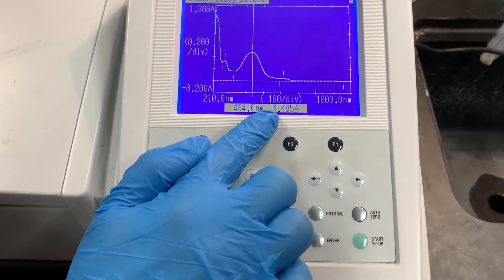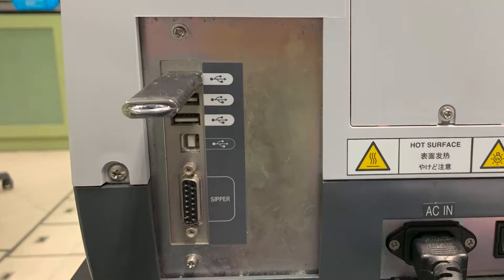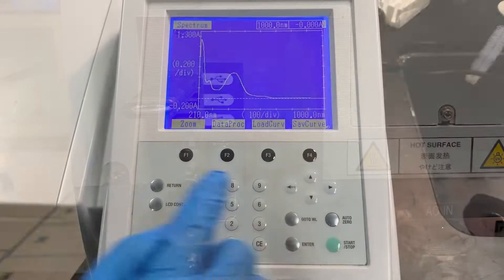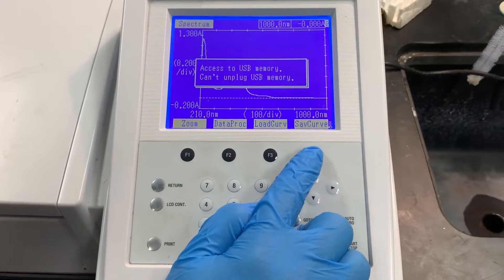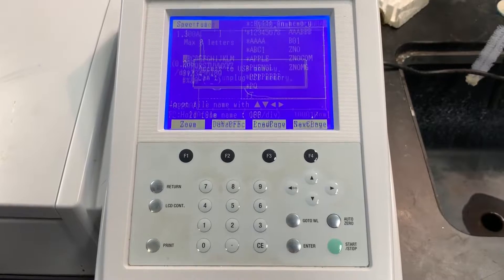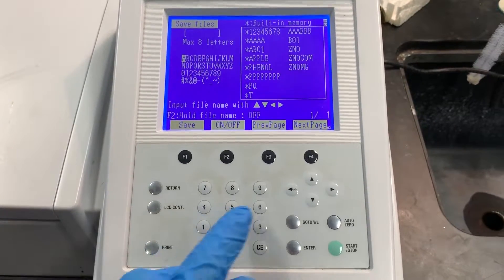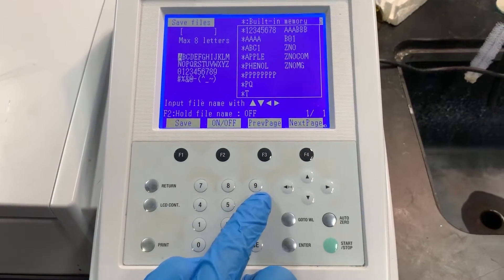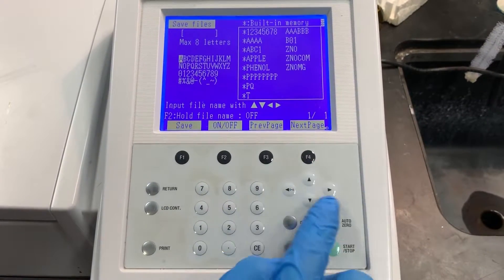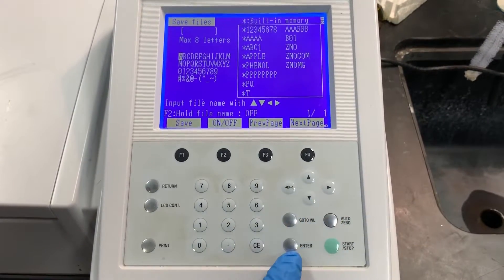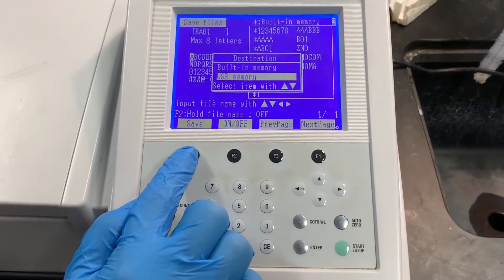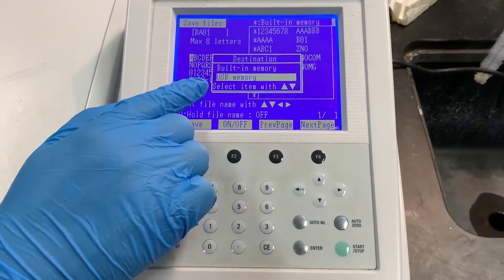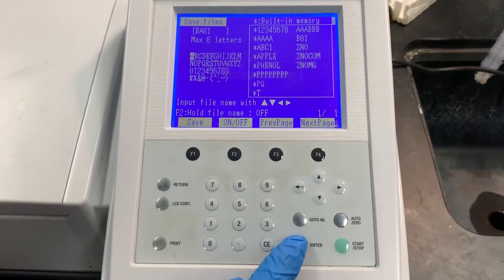To save the file to a thumb drive, plug the thumb drive into the back of the machine. Select save curve. Use the arrow, number, and enter keys to type out the name of the file to save as. Select save and USB memory to save the file.